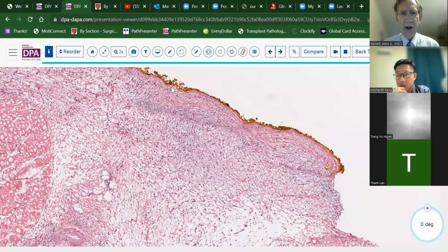And in this particular area, rather than using a black India ink, we have used a yellow or orange color India ink that says that this is a different aspect of the tumor than the black area on the other side of this specimen. And that's very useful for a variety of specimen types, both small skin excisions as well as breast excisions on occasion and other soft tissue excisional surfaces.